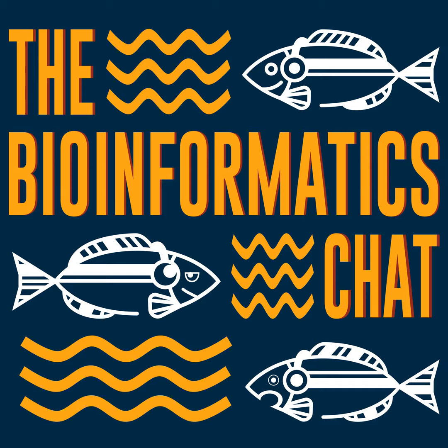So by encoding information at a much lower density, we have a trade-off where we don't have that much density of information, but we have this DIY system where you can mix and match these bits as desired for the final tag. So you say you apply or you ligate the adapter after you order the sequences. Is there a reason the adapters are not just part of the sequences that your provider synthesizes? They certainly could be. We ended up only adding the sequencing adapters after the fact just to save on reaction costs, but there's nothing fundamental that would prevent you from preparing each of these 96 bits with a sequencing adapter so it's truly ready to go.